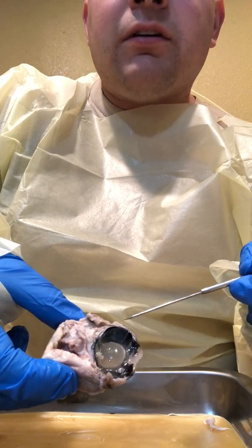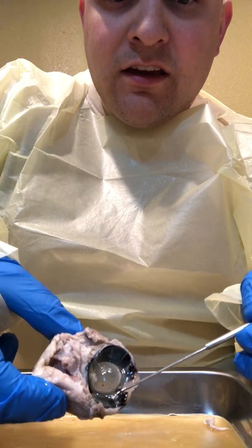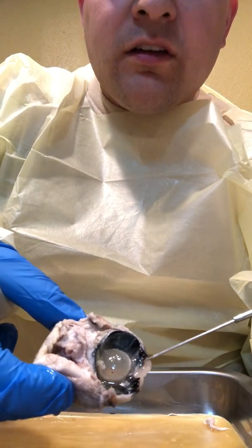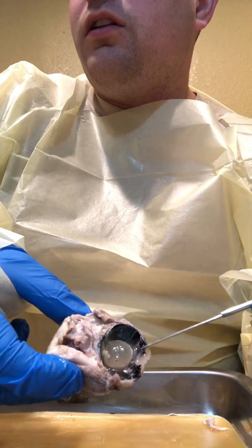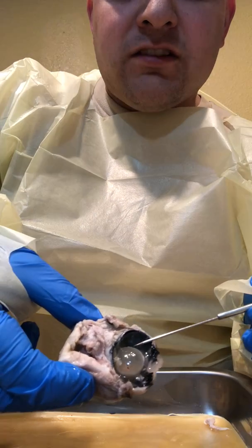Next is the iris, which is going to be right here. This dark tip here. In between this tip and this tip of the iris is a gap that's called the pupil. The lens is actually still intact right here, this bulb.